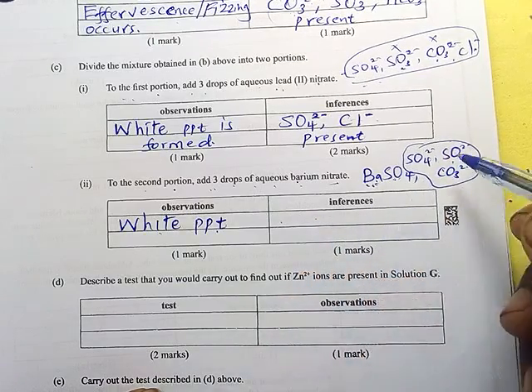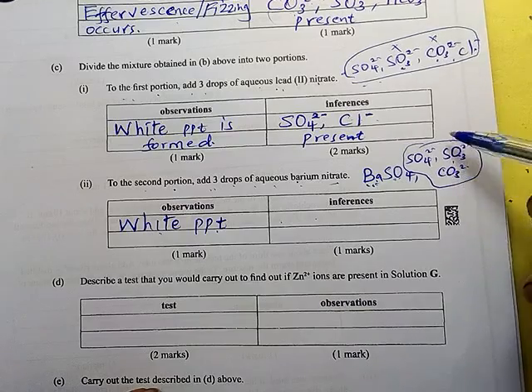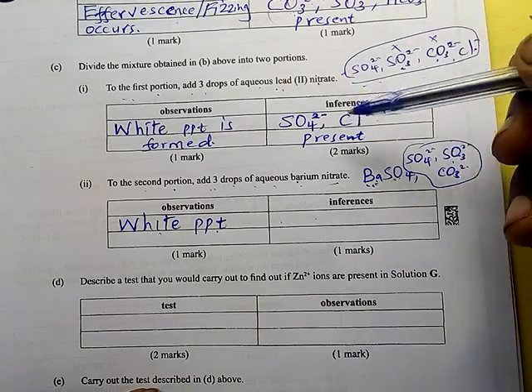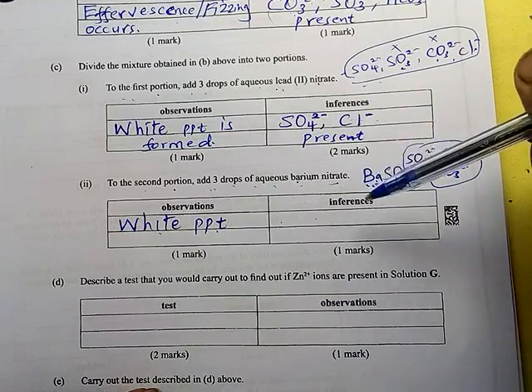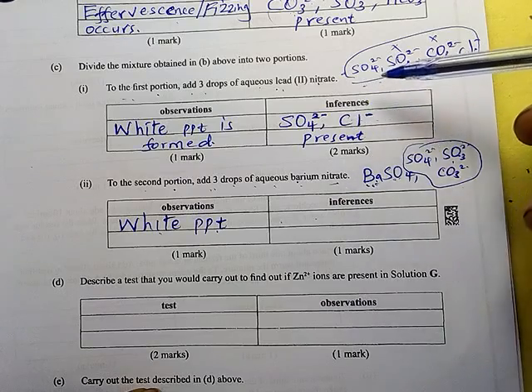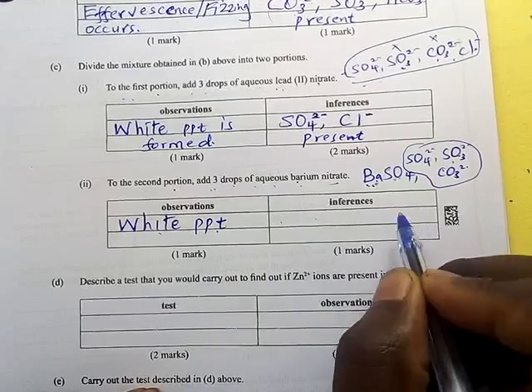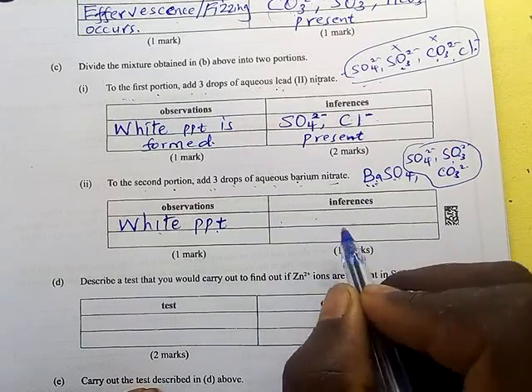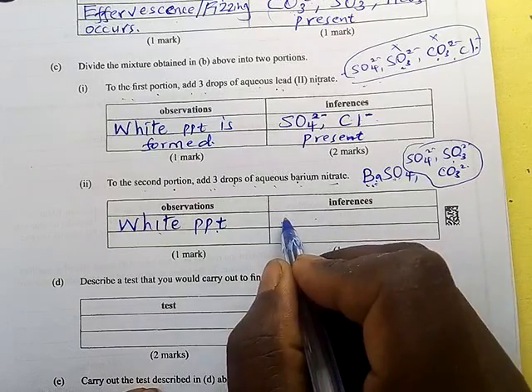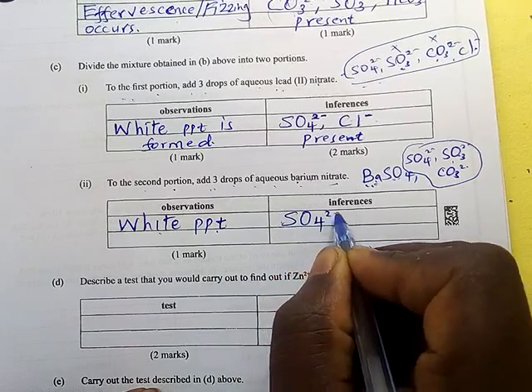But remember, the sulfite and the carbonate were removed here because of the acid which is inside. Because a carbonate and a sulfite will undergo a neutralization reaction to form a colorless solution. A reaction we call neutralization. Therefore, if you include a sulfite here or a carbonate, that one is called contradiction or contradictory answers, and you will get nothing, 0. Therefore, the only answer here is the sulfate, SO4 2-, present.